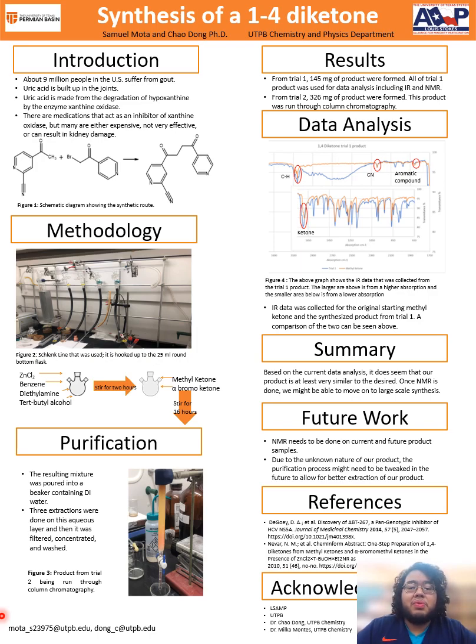In our main reaction vessel we added zinc chloride, benzene, diethylamine, and tert-butyl alcohol and allowed this to stir for 2 hours. At which point we added our main reactants, our methyl ketone and our alpha bromo ketone, and allowed this to stir for 16 hours.